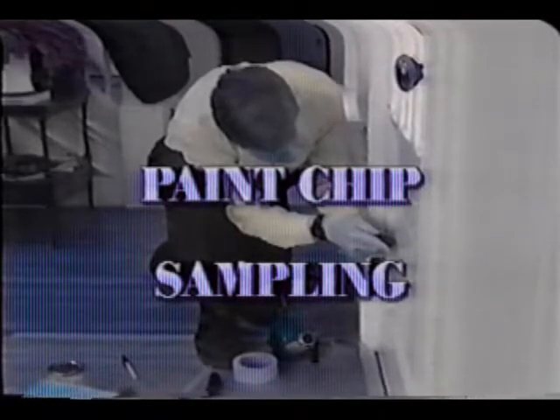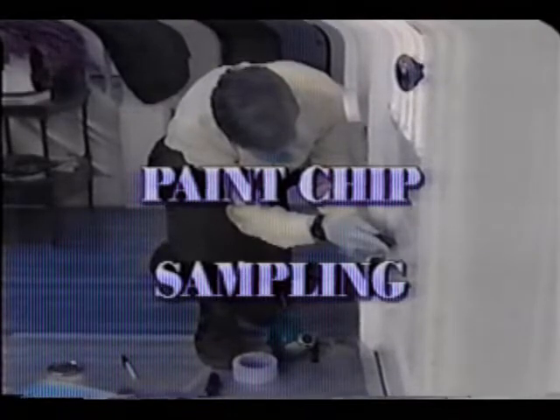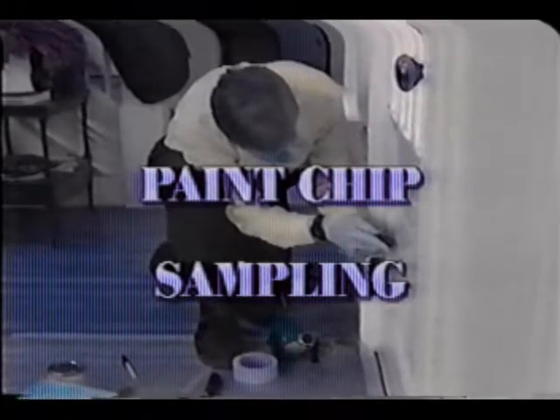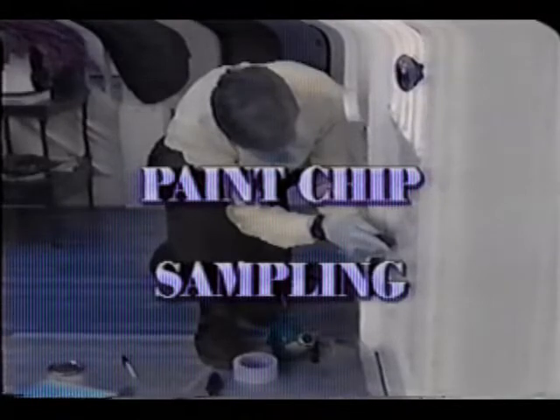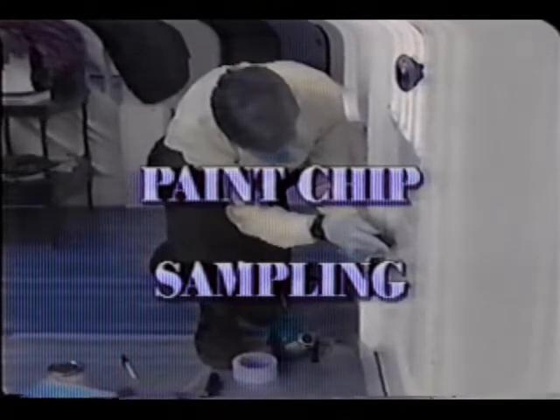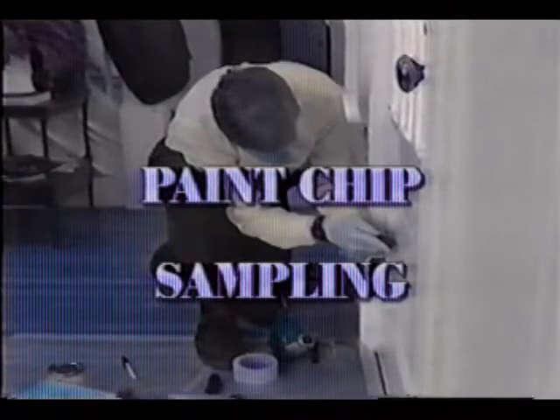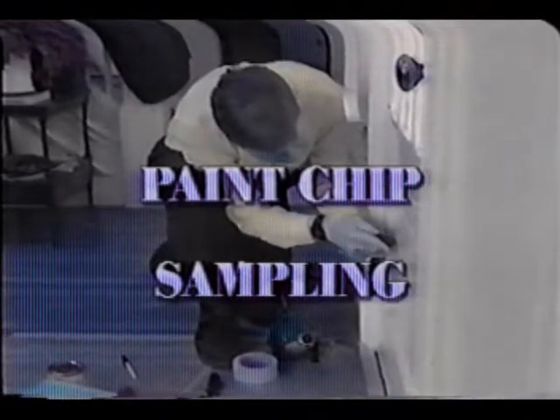You should perform dust and soil sampling before chip sampling to minimize the possibility of cross-sample contamination. Even though samples are collected from inconspicuous areas, residents should always be notified when chip samples are needed. Single surface sampling will be demonstrated here. Your instructor can describe how this method should be modified for composite sampling.